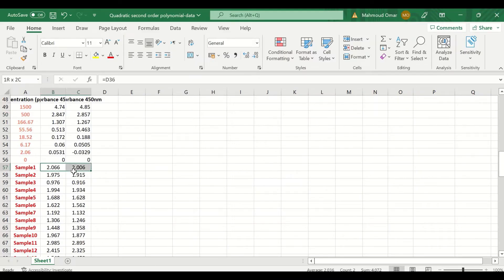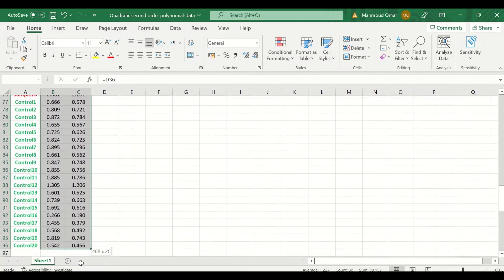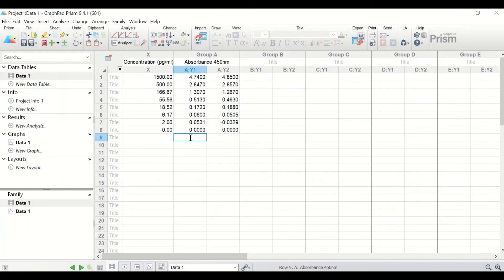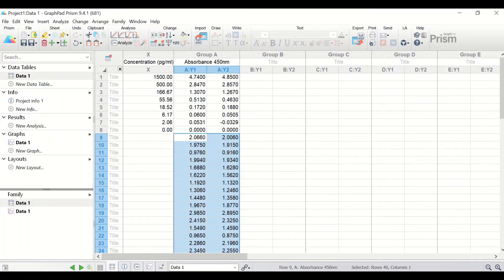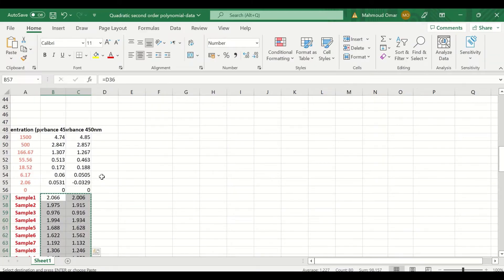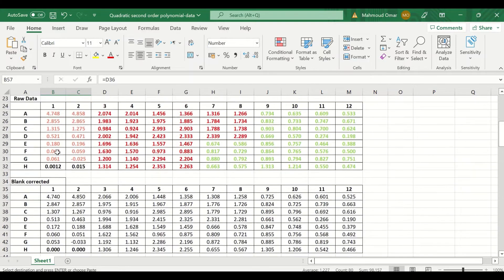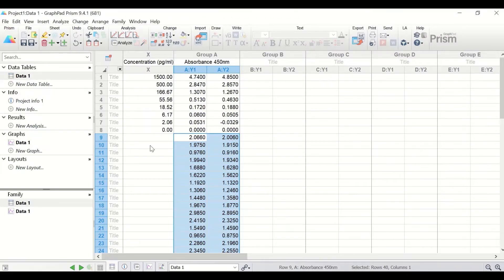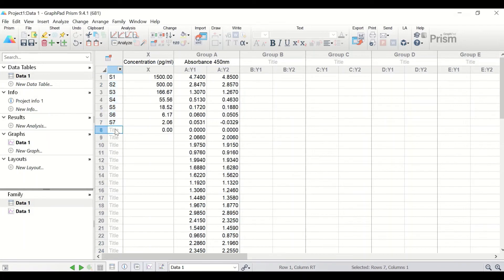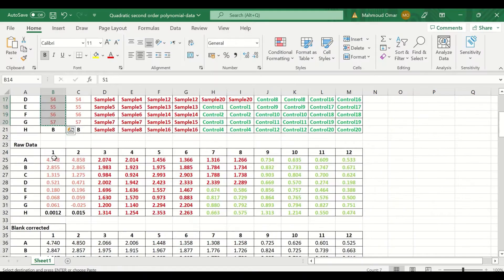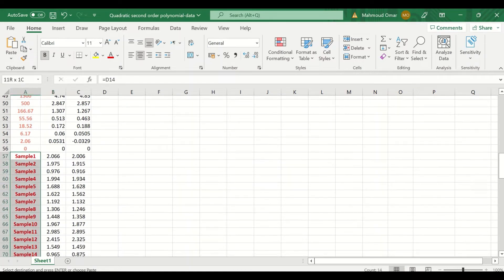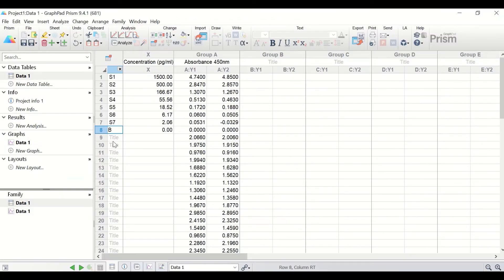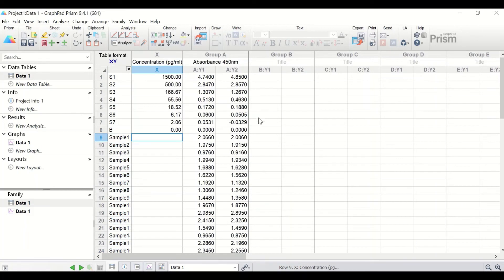Copy the absorbance for the unknown disease and control samples and paste them into the absorbance area. Select the labels for each standard sample and insert them in the appropriate place. Also select the labels for the control and disease samples and insert them in the corresponding area.